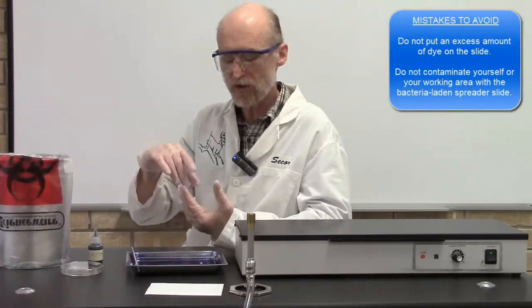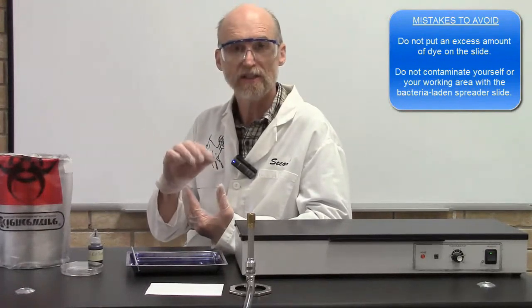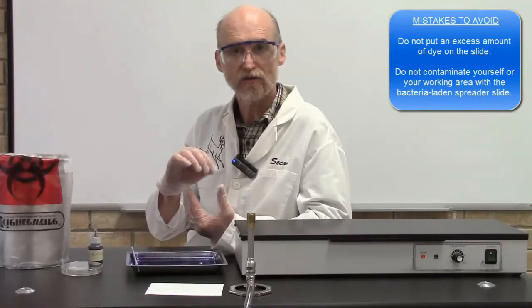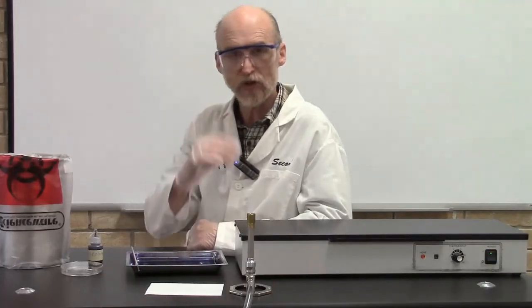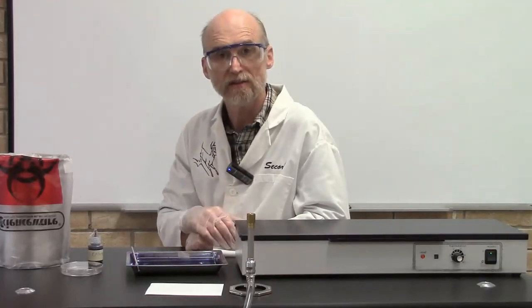Now a few things you want to avoid. Make sure that when you do this technique, you do not put too much nigrosin on the slide because otherwise you'll be waiting forever for it to evaporate. Also, make sure you don't get the slide on your fingers because it's loaded with bacteria. So that's pretty much the technique, and let me show you an image of what the bacterial cells will look like in a negative stain technique.